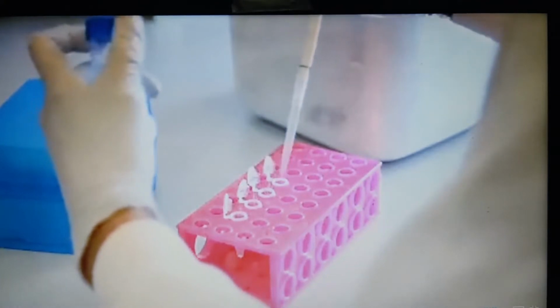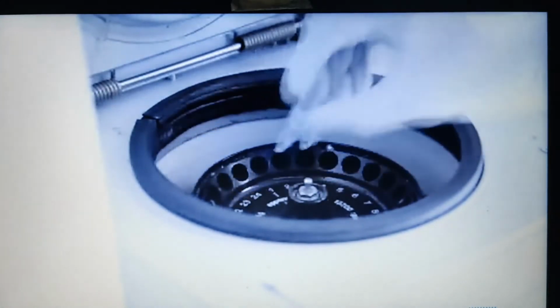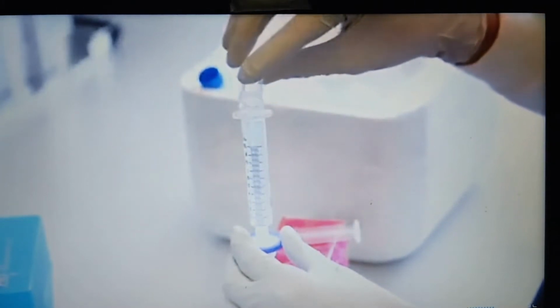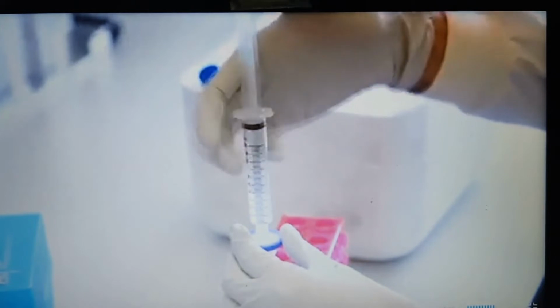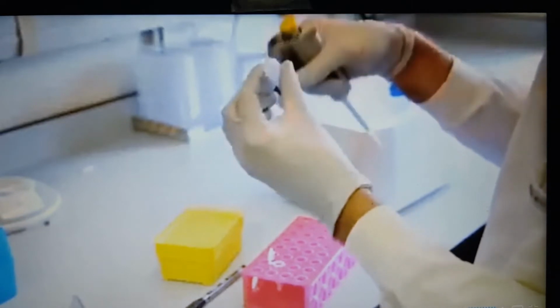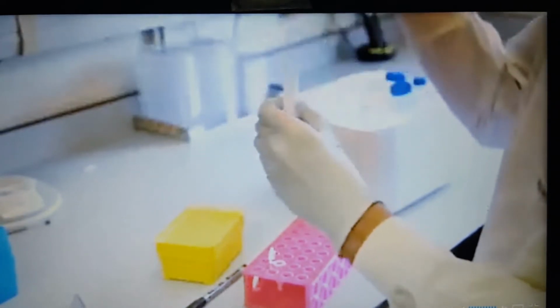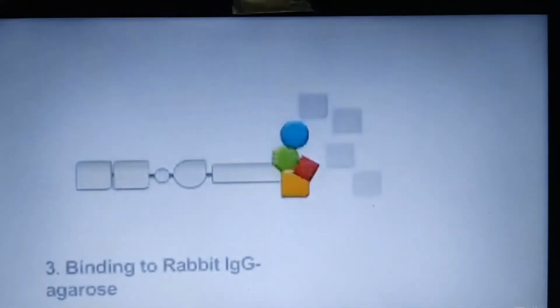The resultant lysate is aliquoted into 1.5 ml tubes and unlysed cells and debris removed by centrifugation. Of note, the pellet size is markedly reduced following this centrifugation step. The lysate supernatants are then combined in a 15 ml falcon tube and passed through a 0.45 micrometer filter to remove any additional debris. A 50 microliter aliquot of this lysate should be taken for subsequent analysis. This sample is referred to as sample 1.